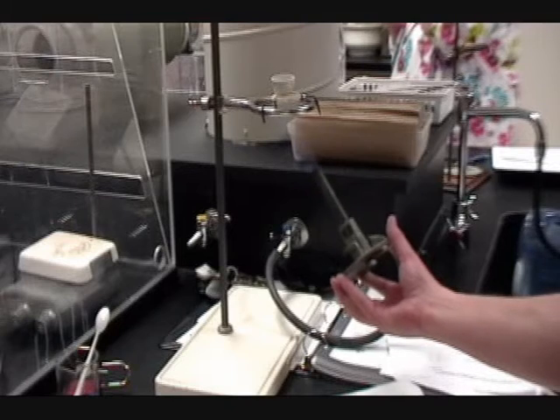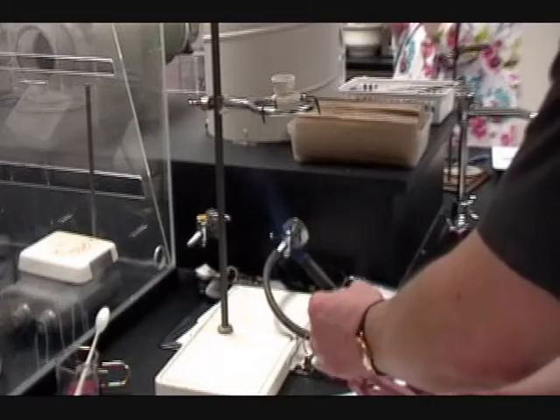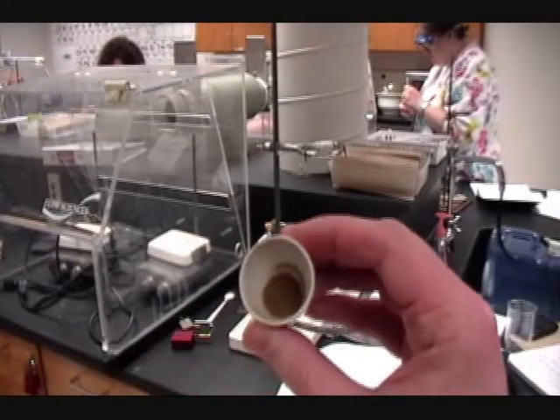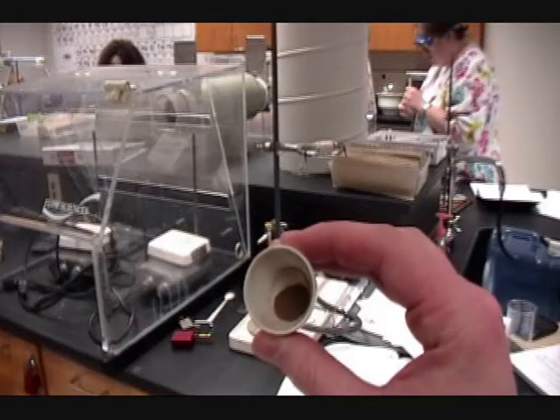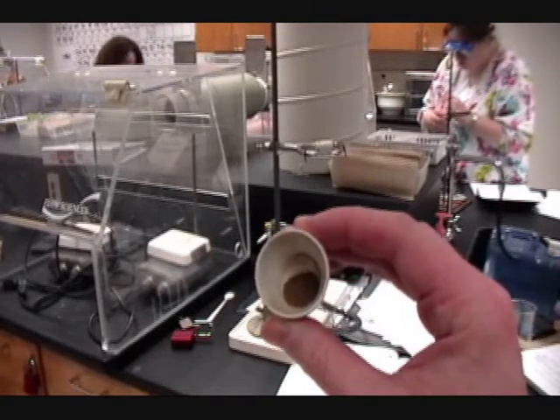Apply heat for a couple of minutes, then remove the heat. Take a spatula and scrape around a bit and look for any blue-green colour underneath — we want to make sure that all of the water is driven off. Then put the Bunsen flame back underneath with the hot blue flame and heat for a little bit longer. If you hear your sample start to crackle, then you're heating too much and should remove the heat source once more.